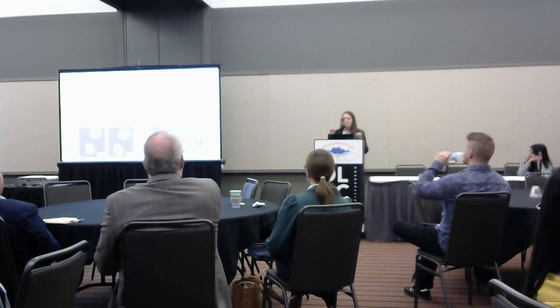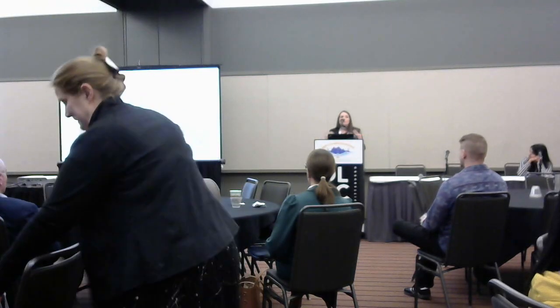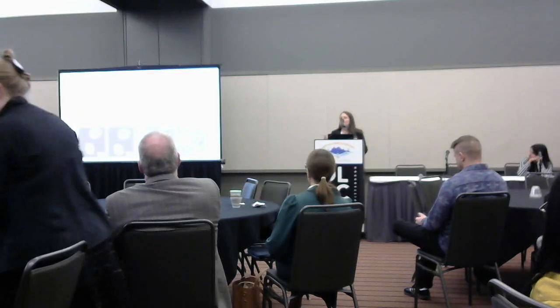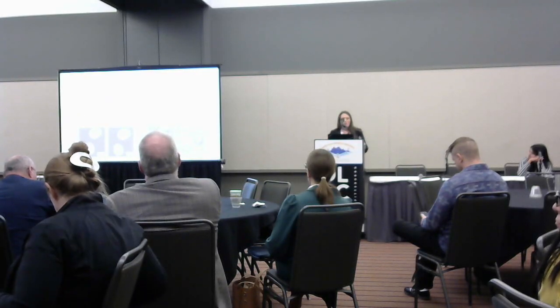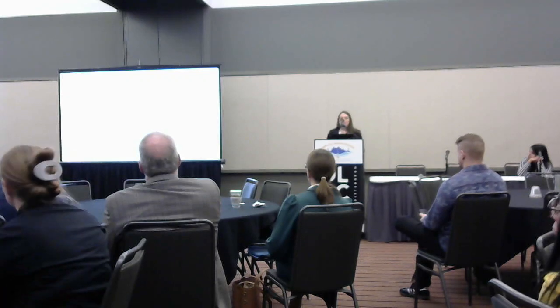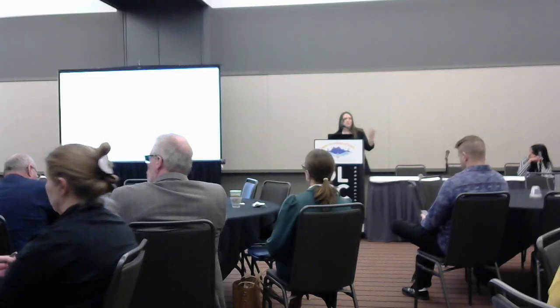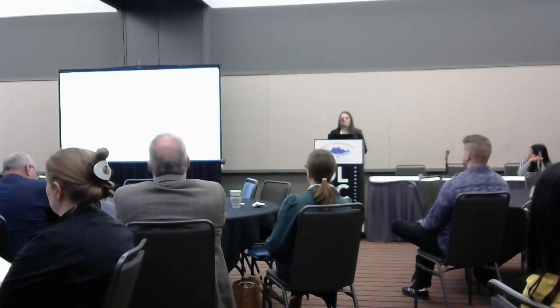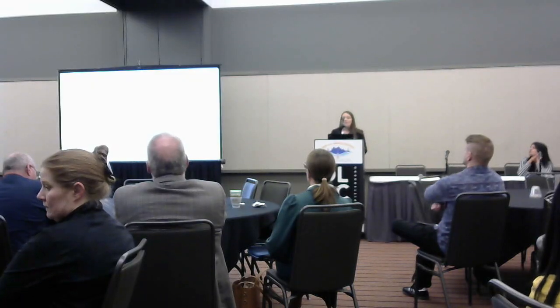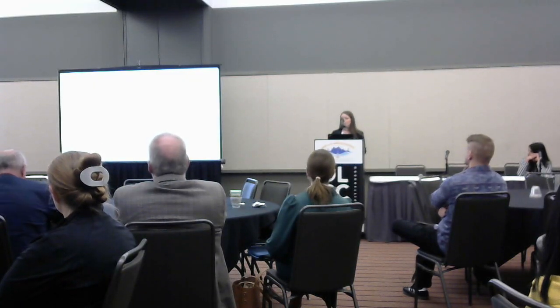So all of these small choices along the way are going to impact your ability to do quantitative analysis and the choices that you have to make when you're deciding how I will approach my quantitative analysis. So how do we make these informed choices? How do I go into something and think, I'm going to choose this microscope over that microscope, this analysis approach over that analysis approach? I think fundamentally, it's understanding the actual image analysis methods themselves.